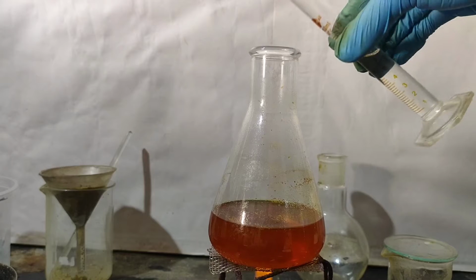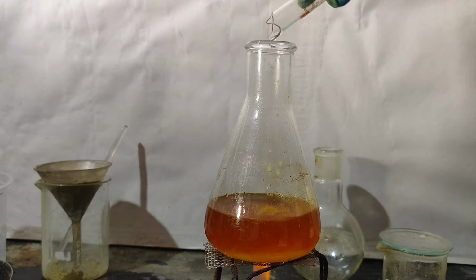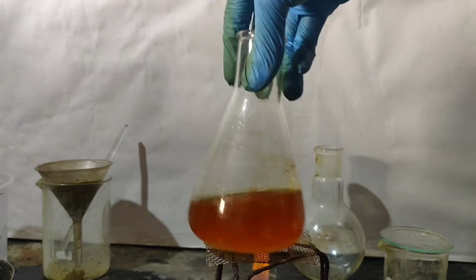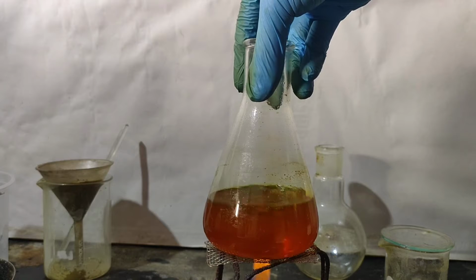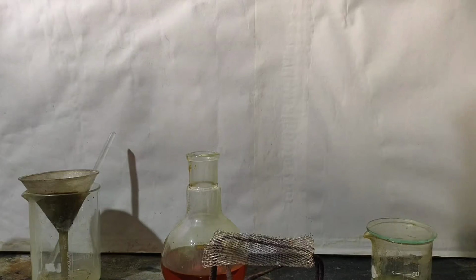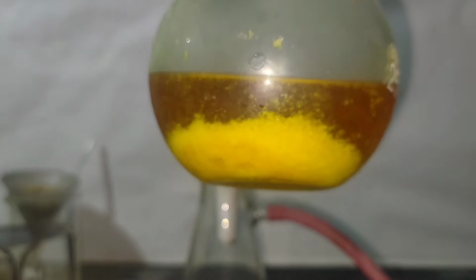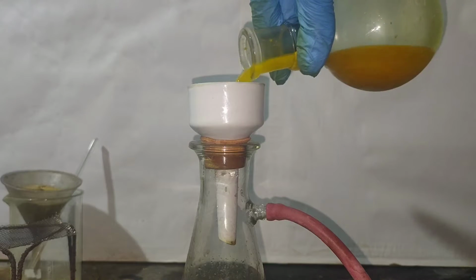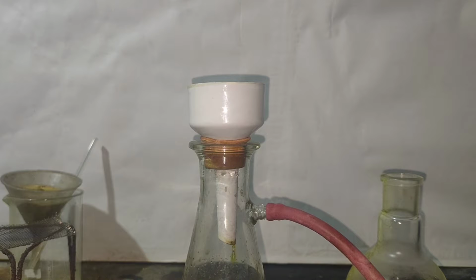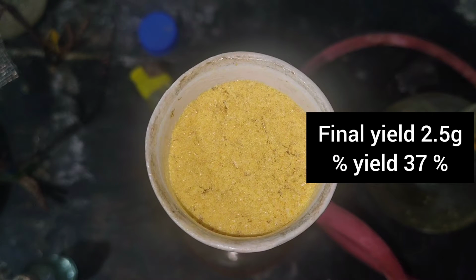Now I added 7 ml of distilled water to it, to make it about 90% ethanol. This will precipitate any tar that is there in the solution. I removed the tar by decanting off the liquid. I cooled the solution to 0 degrees Celsius and yellow crystals of alpha-nitronaphthalene were formed. I filtered these crystals using vacuum filtration on my Buchner funnel. It still looks a little impure. The final yield was 2.5 grams, which corresponds to a percentage yield of 37%.